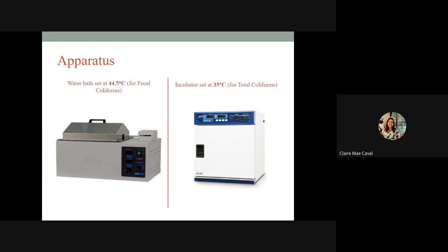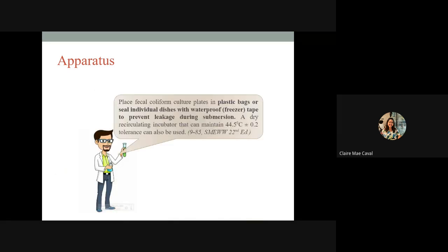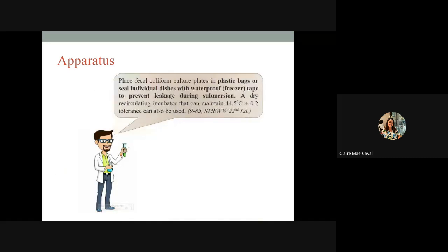But according to the Department of Health and as well as some standard methods for the examination of water and wastewater, it is best incubated at 44.5 degrees Celsius in a water bath. Kasi nga, mas madali yung transfer of heat from water to the medium than the dry recirculating incubator.